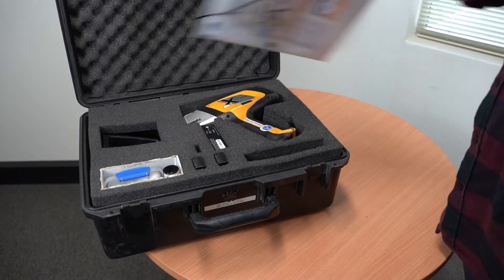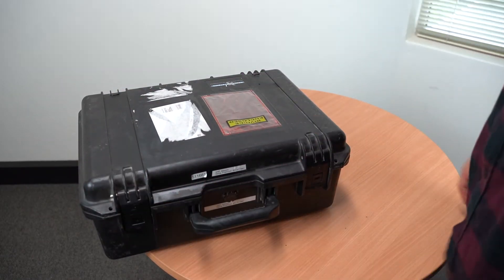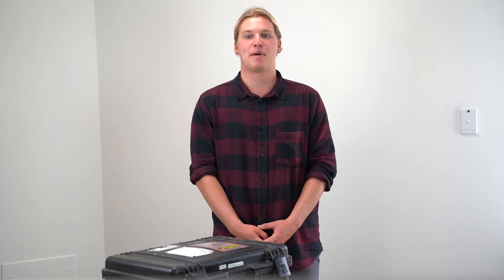If you're hired off us, the hire documents go on top and then you can close the case. And that's how to correctly pack up the Olympus Delta.